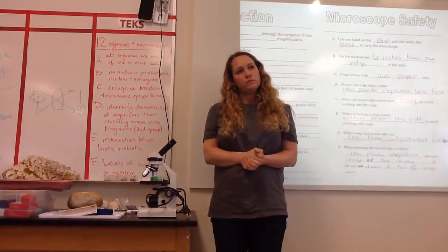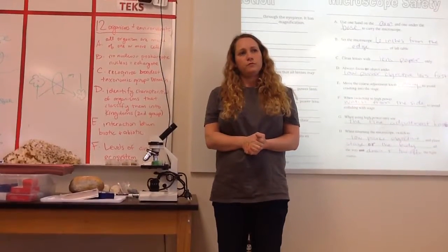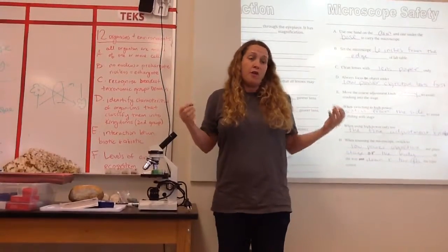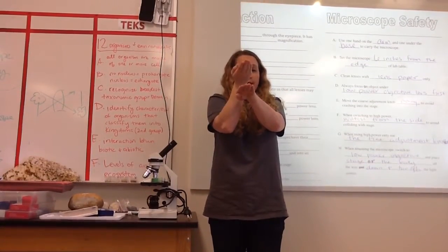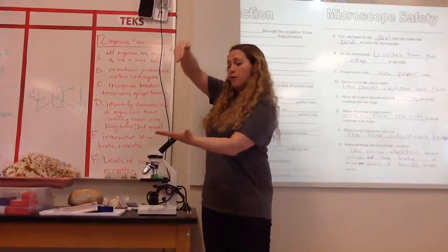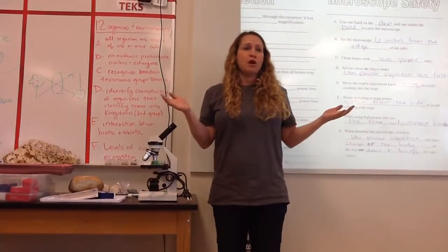So for the big lens, if you push it just a tiny bit where it's just nearly touching, will it break? If they touch too hard, Courtney, they will break. Just like if you clink two pieces of glass together too hard, they'll shatter. It's glass on the upper lens, and it's glass on the lower lens, and it's a glass slide in between. There's a lot of stuff that's delicate right there, so you just want to be as slow-moving and gentle as you can, and you never want to move the objects toward each other unless your eye is looking from the side. Okay? Anybody else?